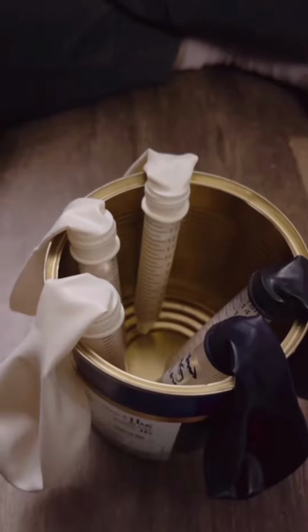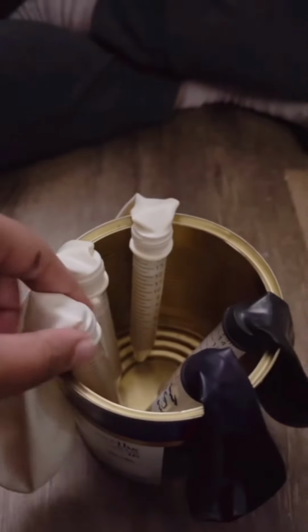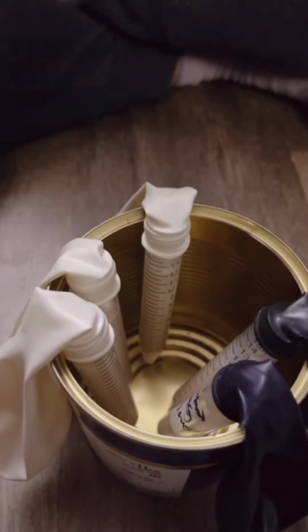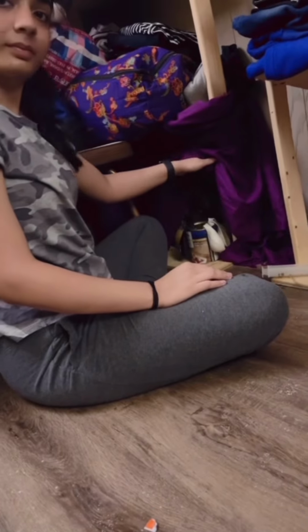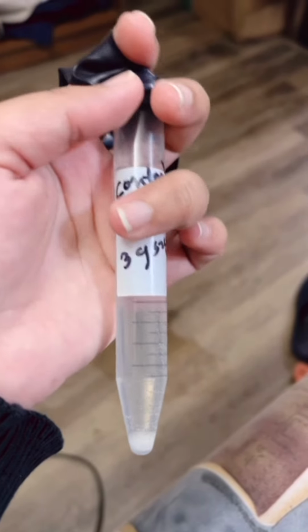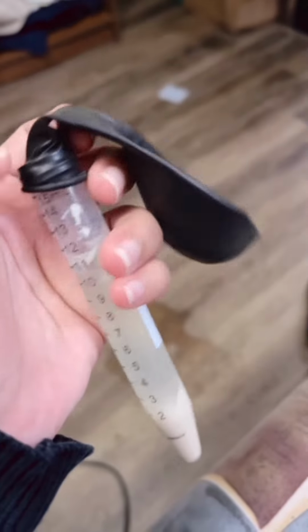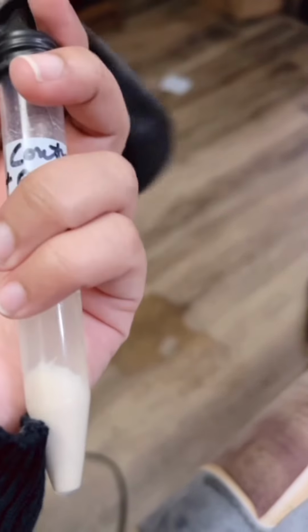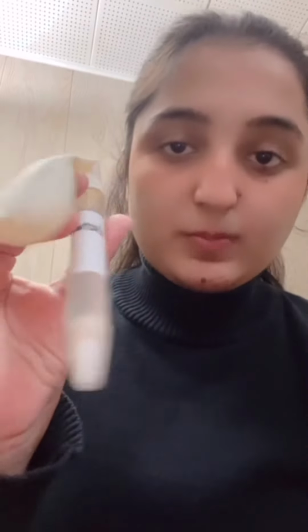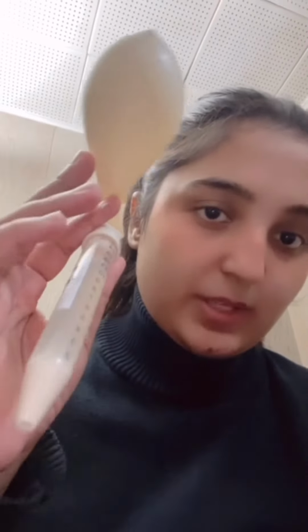After mixing all the contents, we put these balloons over the tubes and put the tubes in these containers, and we will wait for 5 to 6 days to measure the carbon dioxide content. After that, we use the same curtain to put the balloons with the container in the dark. For control 1, which had only sugar, there is no inflation. For control 2, which had only yeast, it also did not show any inflation. For sugars, least fermentation was shown by lactose and yeast, followed by sucrose, and the glucose mixture with yeast showed the most fermentation and carbon dioxide formation.